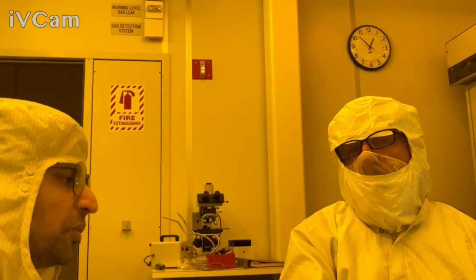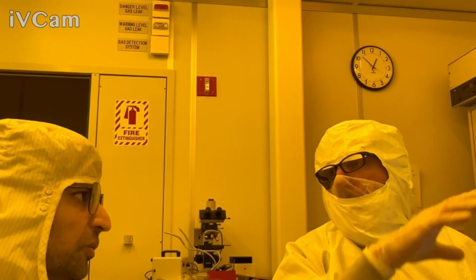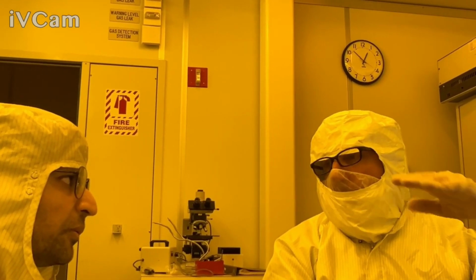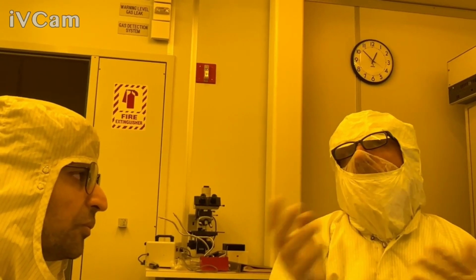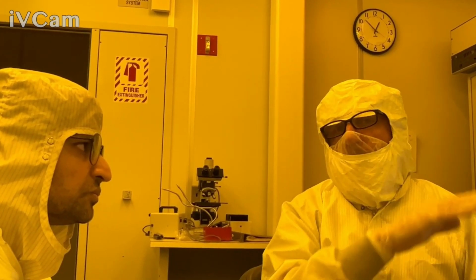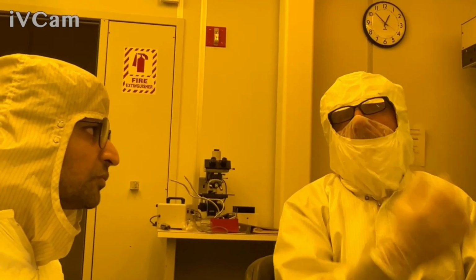Your AFM is actually doing a profiling type of measurement. We're looking at how the polarized light moves. So the influence of a surface layer, as long as there's an optical contrast between that layer and what it's on, and if there really is roughness, as long as the roughness is much less than the wavelength of light that we're probing it with, so usually less than 1/10 of the wavelength, then it'll still look kind of specular to us. It's not scattering like a grating.